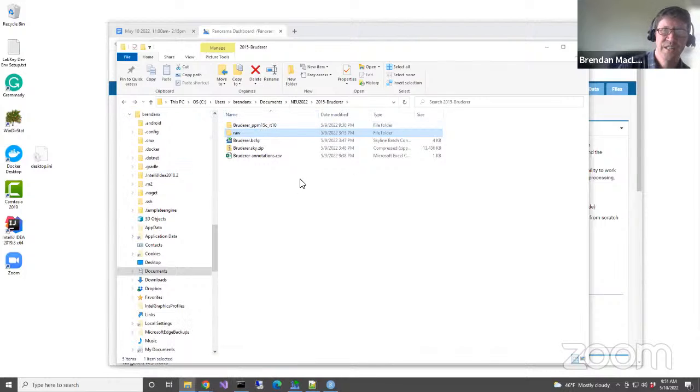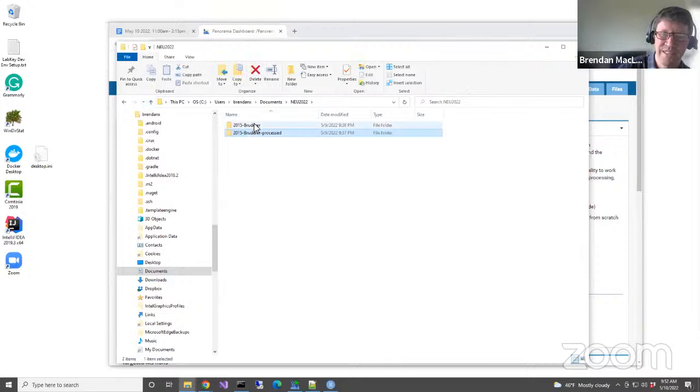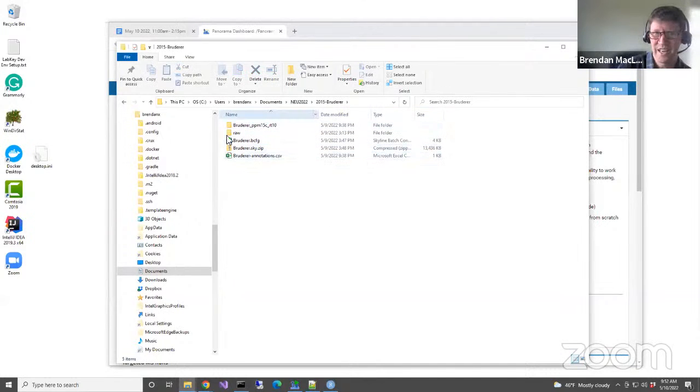We're going to do this more from the perspective of, okay, we could just run everything with this BCFG file, and that's basically what I did here. Oh no, this is actually fully processed with my own processing. But I have definitely run everything with BCFG, and you get absolutely everything completely processed on your own machine. But what we're going to do is do it as if we were trying to set this up for ourselves the first time, as if we didn't have this BCFG file.